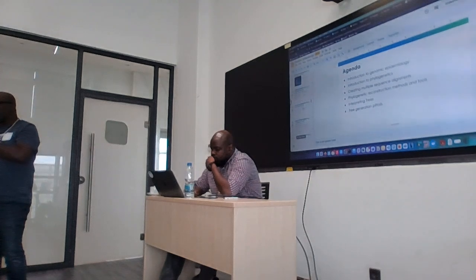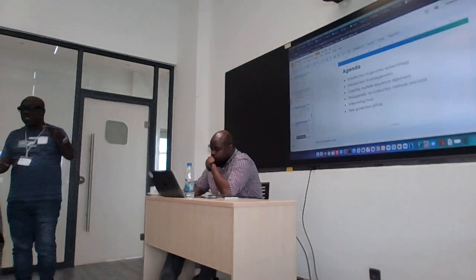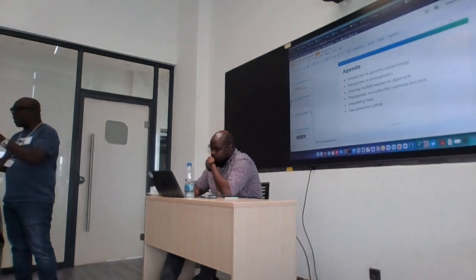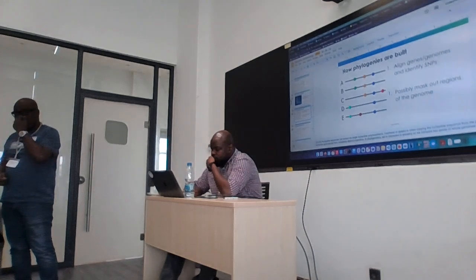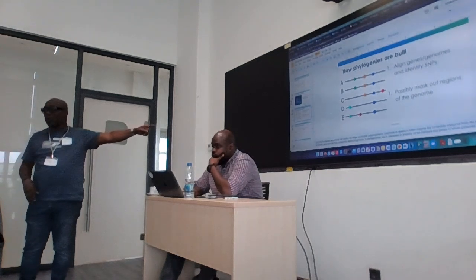Et l'alignement multiple se fait avec plusieurs options. Ces options-là, c'est soit insérer des gaps, soit autre chose, il y a plusieurs options pour faire l'alignement multiple. Et comme nous, on ne veut pas manipuler chacune des options, on va utiliser un outil qui va faire l'alignement pour nous. Cet outil-là s'appelle MAFFT. Et on va lui dire de choisir lui-même les meilleures options d'alignement. C'est pour ça qu'on met auto.